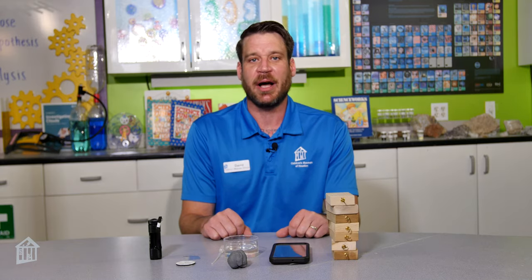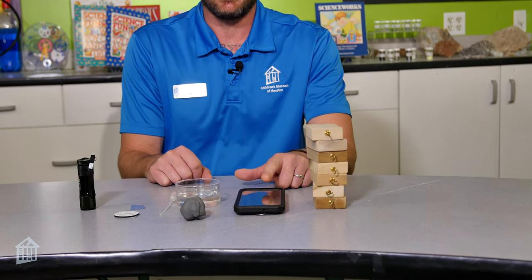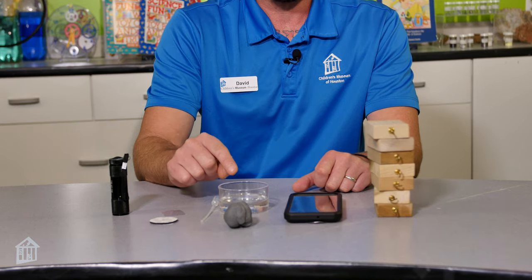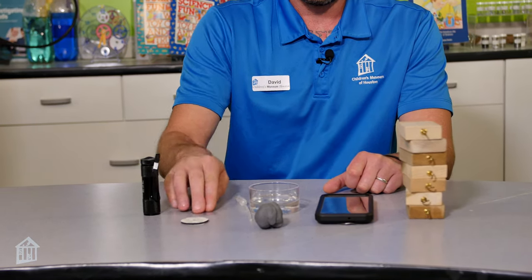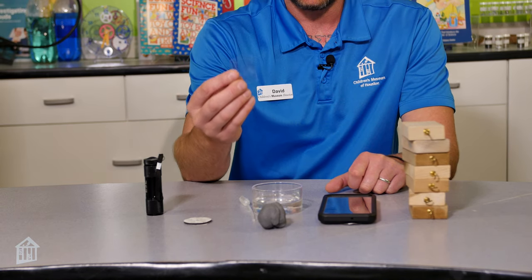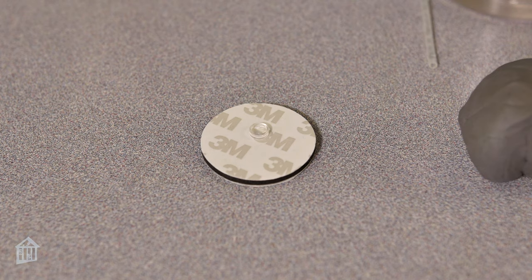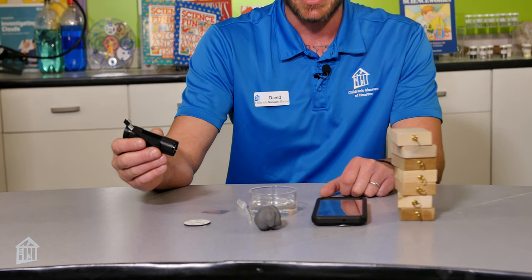Today's activity is a DIY microscope. For this activity you'll need wooden blocks, a smartphone, some modeling clay, water from a pond or a puddle, a pipette, a piece of translucent sturdy plastic — I got this from a laser pointer package — double-sided tape, and the lens from a laser pointer. Just remember when you take the lens out, the laser pointer will not work anymore. And the last thing you'll need is a flashlight.